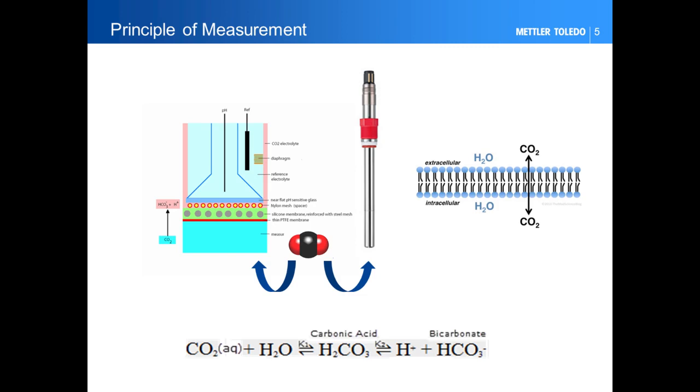A carbonated buffering system inside the sensor is surrounding a micro pH sensor that is measuring variations of dissolved CO2 content in culture media. So dissolved CO2 is passing the sensor membrane to be quantified. The principle for measuring the pH is explained by the Severinghaus equation as displayed.